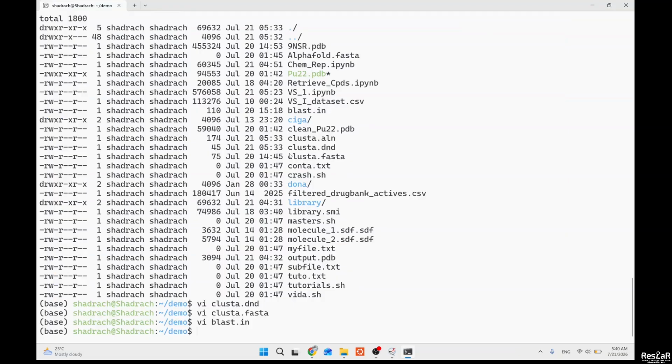Now, remember the last time in the course we mentioned the issue of if you have a protein and you want to pre-process it and fix missing residues in your protein, how do you go about doing that? There are a whole lot of tools to do that. If you're working on many other software, Schrodinger, Chimera, there are many ways to fill in missing residues. We're just going to work on a very, very simple method, which is, as I showed in the lecture, PDB Fixer, a standalone online tool that you can use.